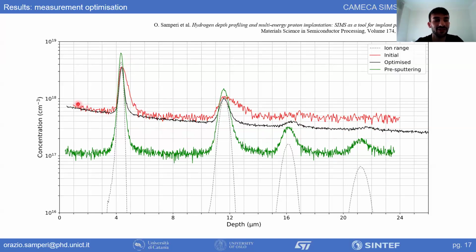It's the background. The background changes. So if you are going to use this measurement for repeatability or reproducibility purposes, it's not really good, because you have to perform a mathematical operation on this measurement, that is, subtract the background.